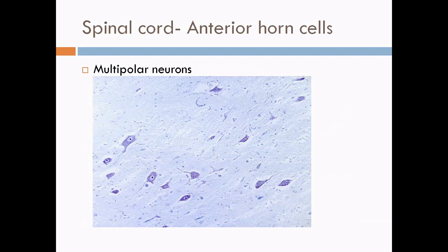This is a high power section in which we can see the cell bodies of the motor neurons which are multipolar in nature. They have an open nucleus with a prominent nucleolus.